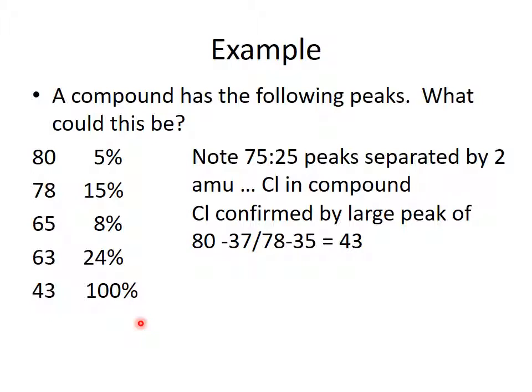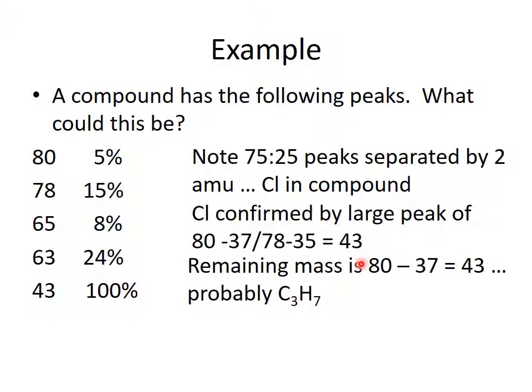That's really common with the halogens, that they have a peak for just the chlorine or the bromine flying off as a free radical and leaving the carbocation behind. So this is the rest of the molecule right here, and it's showing up as a base peak. How many carbons does that contain? Well, if I divide 43 by 12, I get 3 point something. So the maximum number of carbons you can have is 3, which is a mass of 36. So 3 carbons and 7 hydrogens is what adds up to 43.